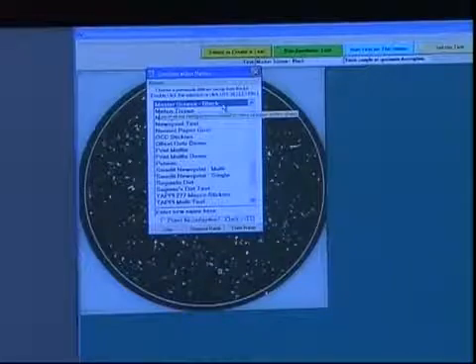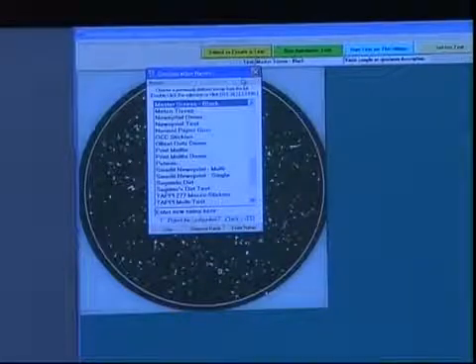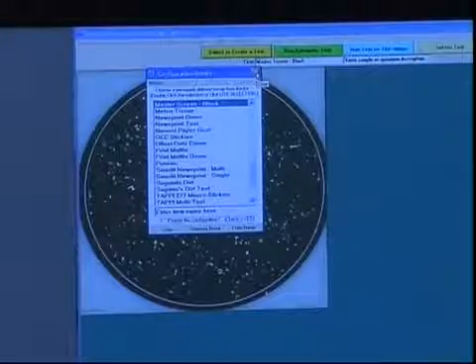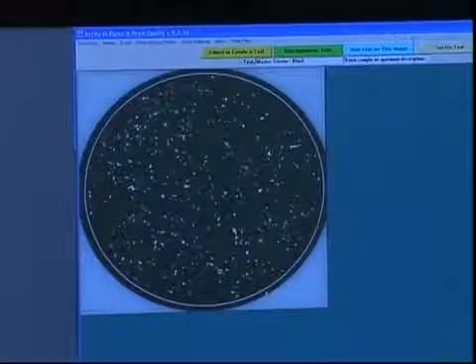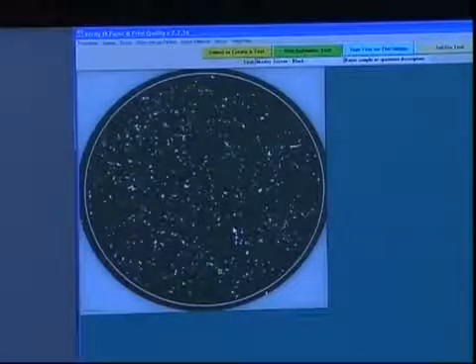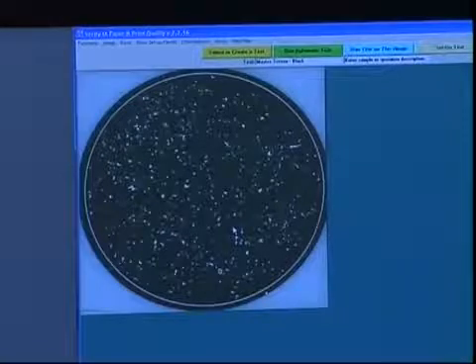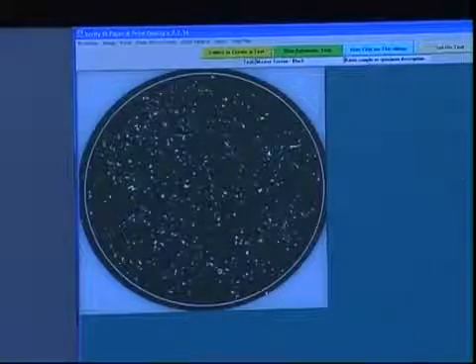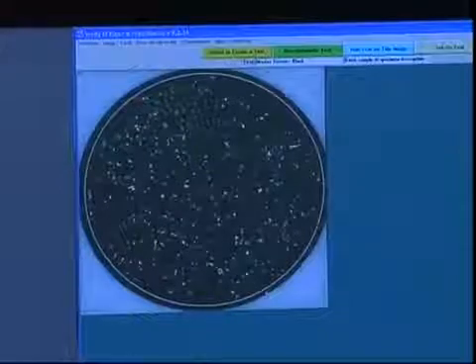We've selected the master screen, which is what the name of the Pulmac is, a Pulmac master screen, and the black image area. So we're done with that. This is the scanned image that was stored in memory, done previously. And you'll notice up here in the right-hand corner, we have 3 classifications.